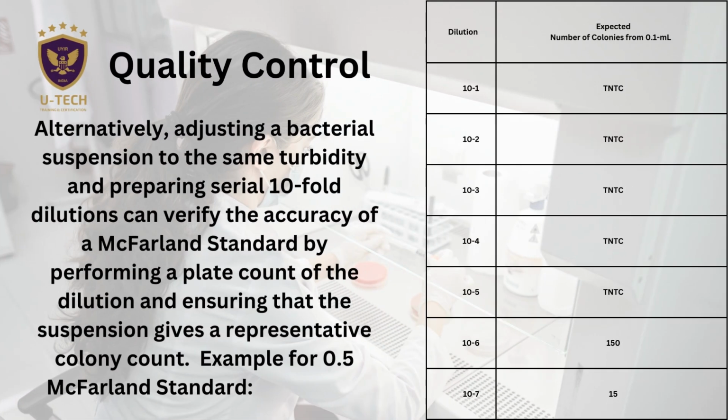Alternatively, adjusting a bacterial suspension to the same turbidity and preparing serial 10-fold dilutions can verify the accuracy of a McFarland standard by performing a plate count of the dilution and ensuring that the suspension gives a representative colony count.